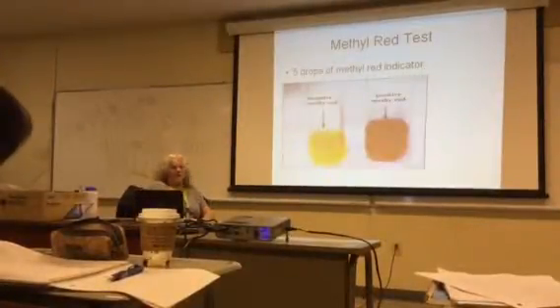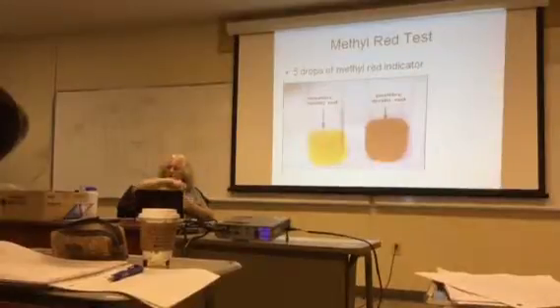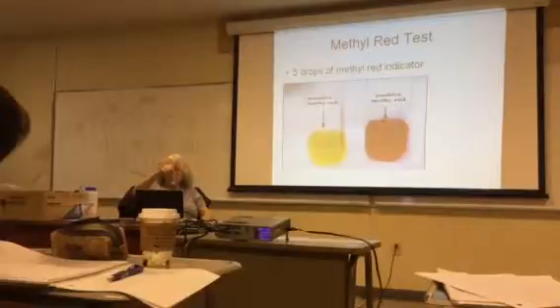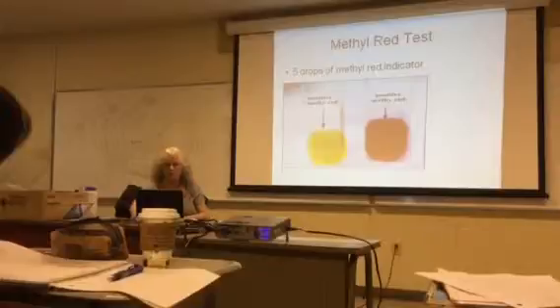You're going to add five drops of methyl red indicator. After you've added your five drops, give that tube a little swirl — otherwise I've noticed it just sits on top of the media. With the methyl red, you do mix it so it goes throughout the media.